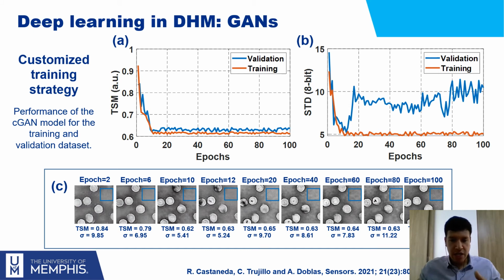For instance, when a reconstruction is well compensated, we don't expect a lot of phase jumps due to the unwrapping procedure. If an image is not properly compensated, we will see a lot of fringes that are the result of a tilting angle, of a non-telecentric scheme, or different sources of this kind of noise. So if we have a properly compensated image, its background and overall the number of phase jumps must be limited.